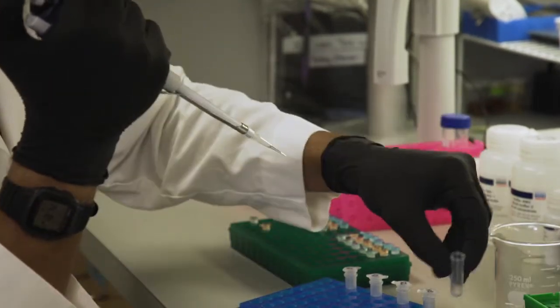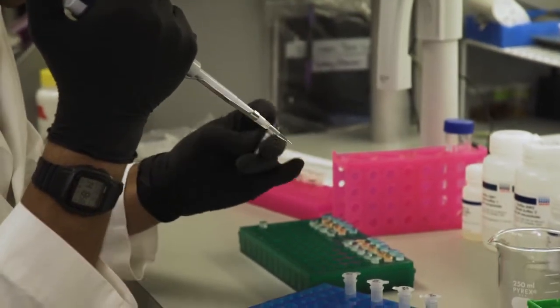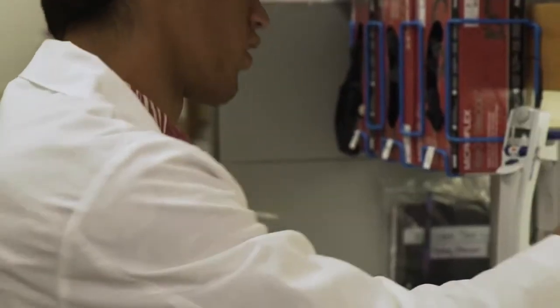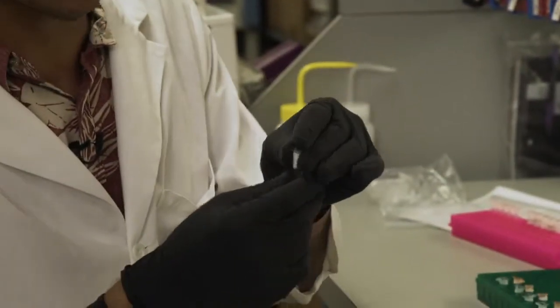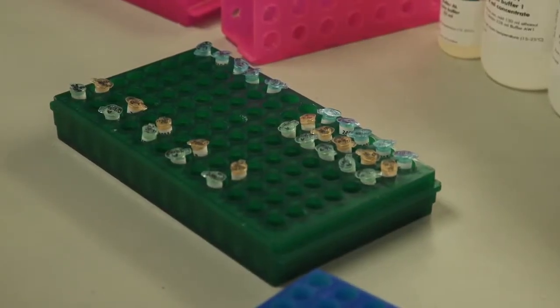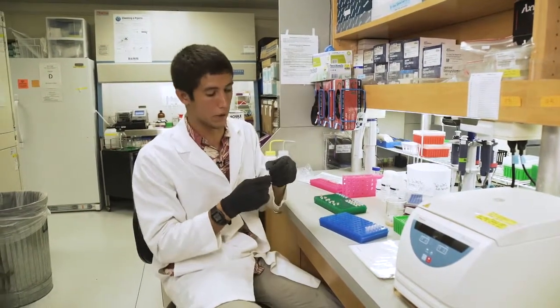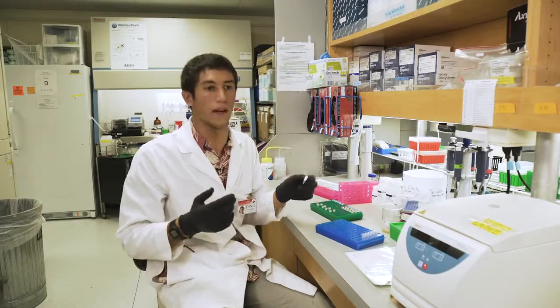All right, that one's done. All right, so there's our DNA extraction. After this, these get thrown into a very, very cold freezer, usually at minus 80 degrees Celsius, just to make sure that they stay stable. DNA sitting at room temperature will eventually degrade and break down. We're going to go ahead and spec these on our spectrophotometer, and we'll see how pure the DNA is and help quantify it roughly.